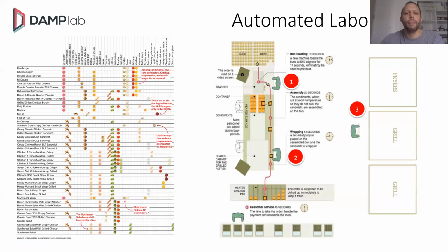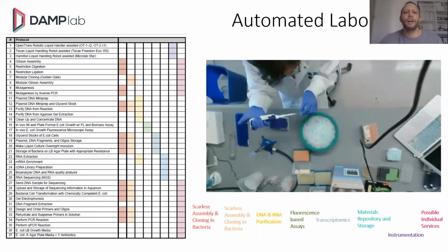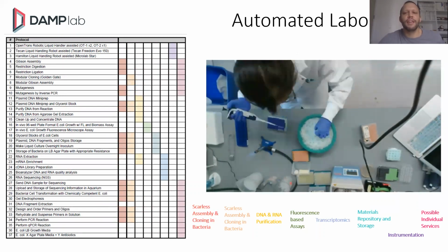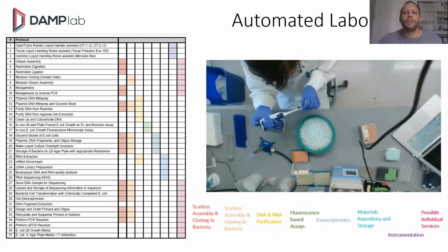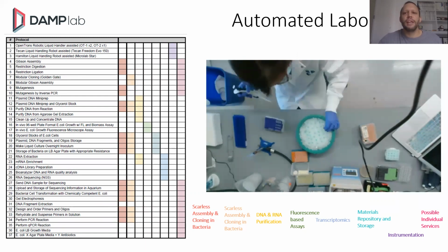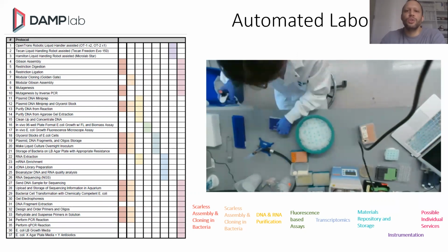So McDonald's operates by making many menu items with a relatively fixed and small set of ingredients. Those sets of ingredients are put together by technicians in a highly replicable way, in a very standardized and high throughput manner. Similarly, our menu, so to speak, has 38-ish protocols made from a relatively finite set of services and techniques. Then technicians can go about doing this in a very replicable, relatively high throughput, standardized and tracked way. And also the technicians can have a standardized training regimen by which we can convert undergraduates into automated laboratory technicians.